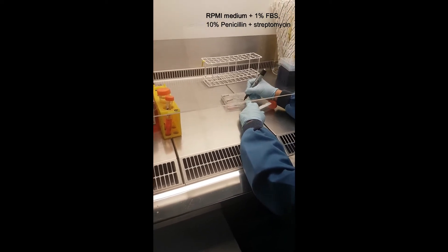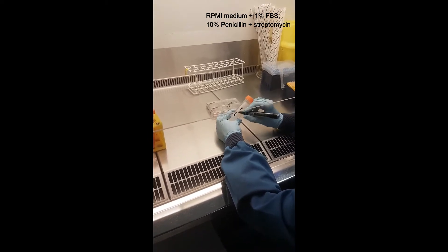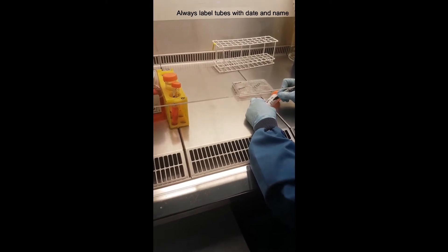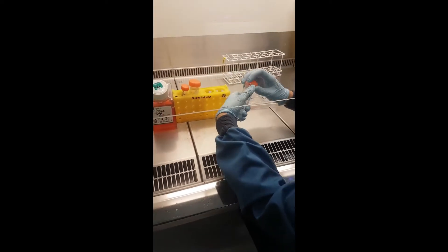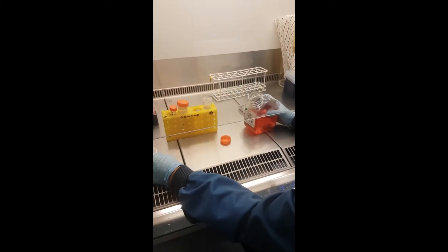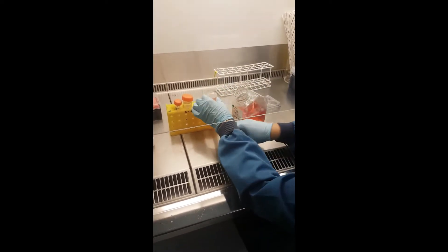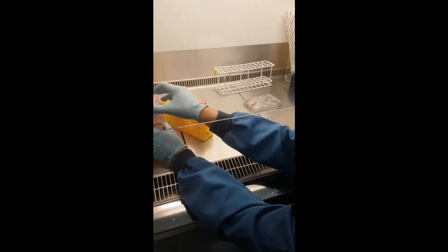The medium we use is for the E0771 cells. This step you don't need to do yourself because the medium should already be ready for you — just make sure when you start that there's enough, and if not, it can be refilled for you.